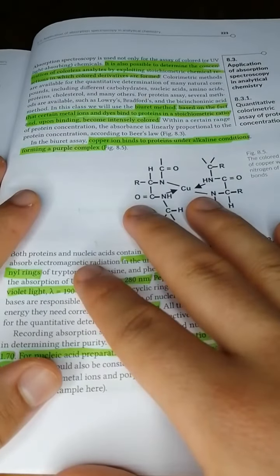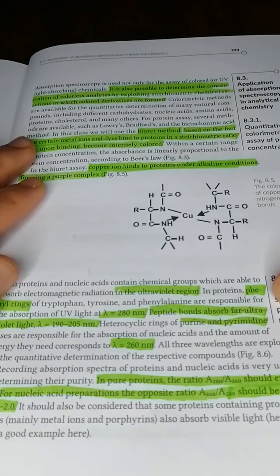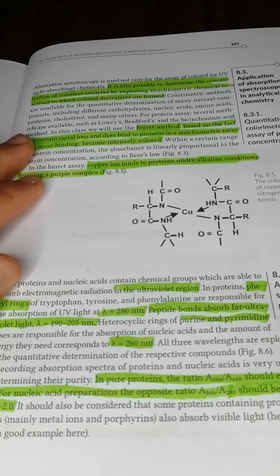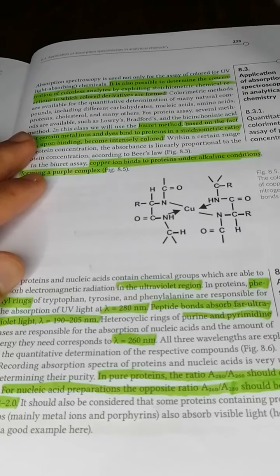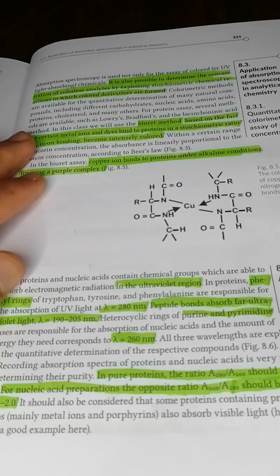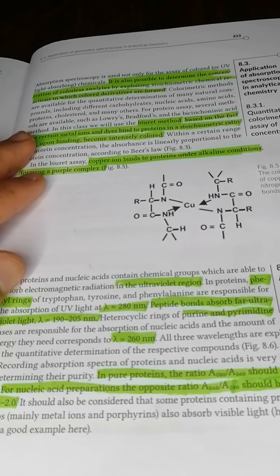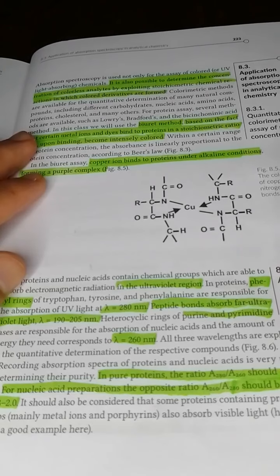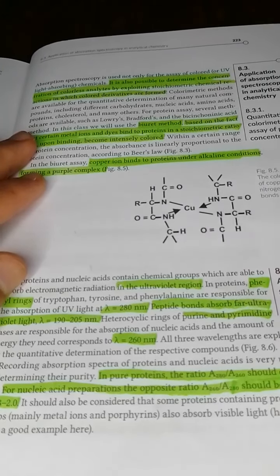And moving on, here it talks about the absorption of certain bonds in molecules. If we have a colored assay or a colored sample, it's pretty standard to measure the concentration of the molecule, because you know the absorptivity and you can figure out the concentration using Beer's law.